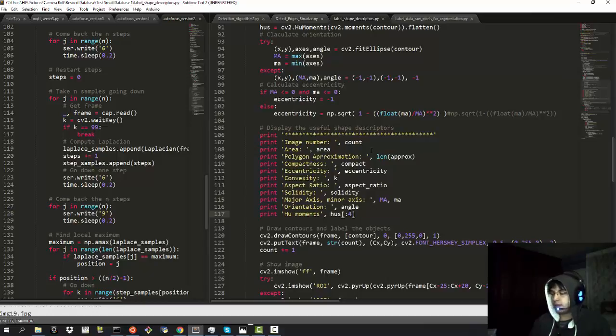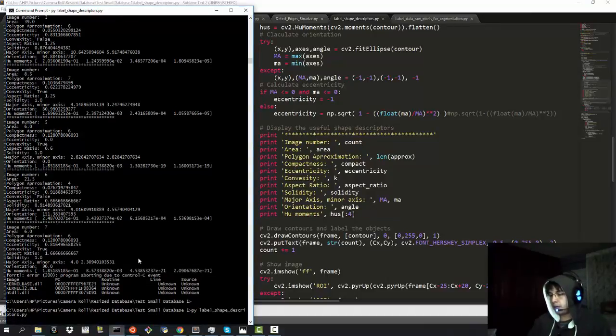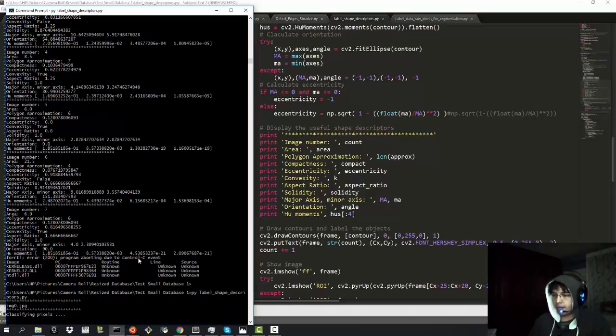Based on that, we can build a program. I have made this program, and it's going to make my life easier, as you will see, because it's going to be a whole journey to make this. As Andrew Ng says, whenever people make classifiers, they take a lot of time collecting data and labeling the data. It takes a lot of time, and as I'm labeling the data by myself, you will see that it's not that easy. Besides, we need a database of at least 1,000 samples in order to have something good.